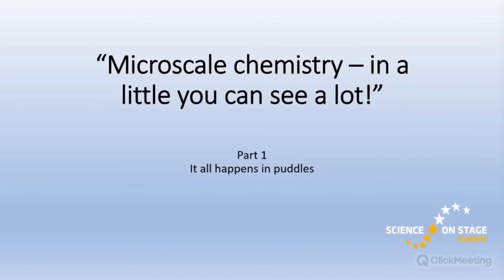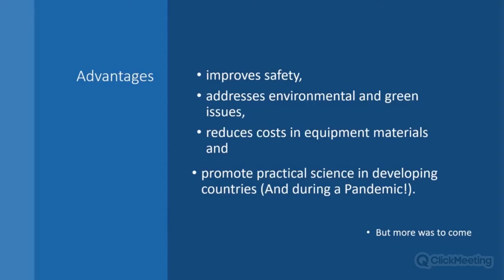You'll see more about this when we start the video. So what we're going to see is everything happening in puddles. I came across these types of reactions through my job at CLEAPSS, which is at the back here. We deal with all the safety in school science and design technology in England, Wales, and Northern Ireland. Scotland have their own organisation called SSERC, which Adrian referred to.